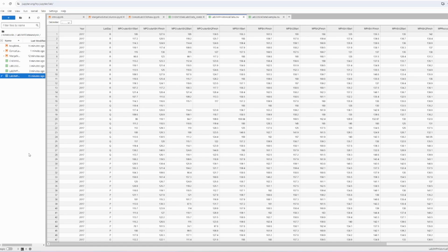So for lab 3, we're doing a melting point of all our substances, and we have some historic data that we are going to compare everything to. So we've got a different file. This one here is the one that contains all our mass data, and this one here now contains our melting point data, and we'll have a separate one as well for our TLC data.